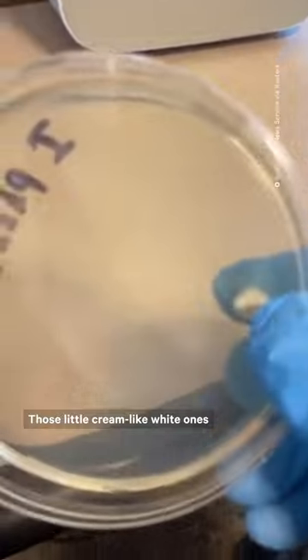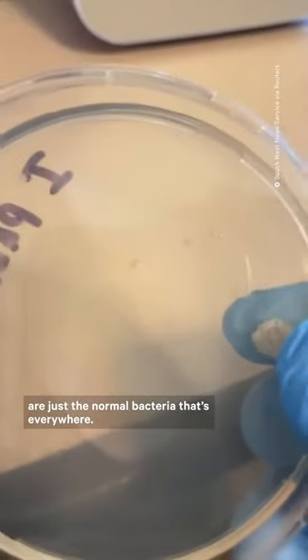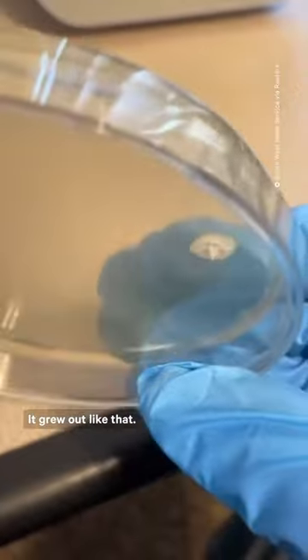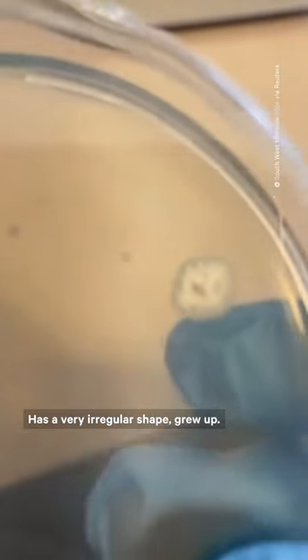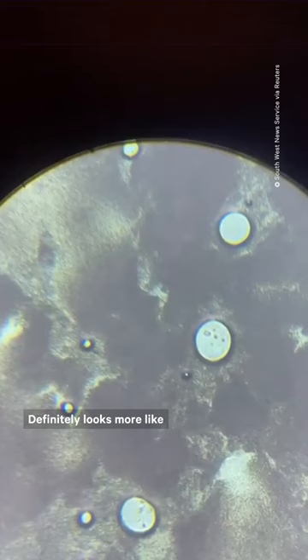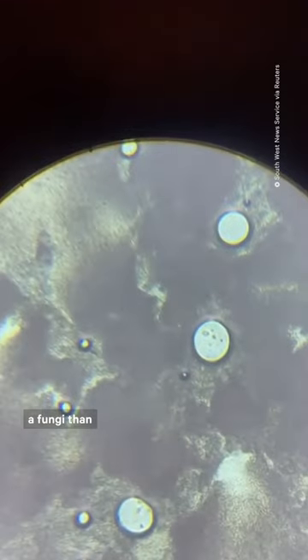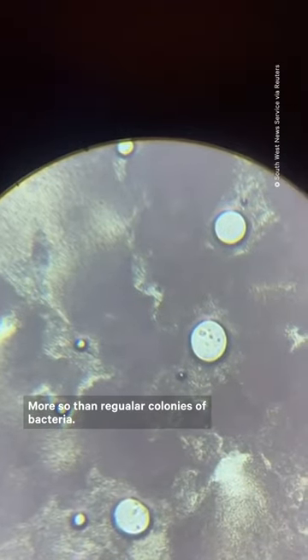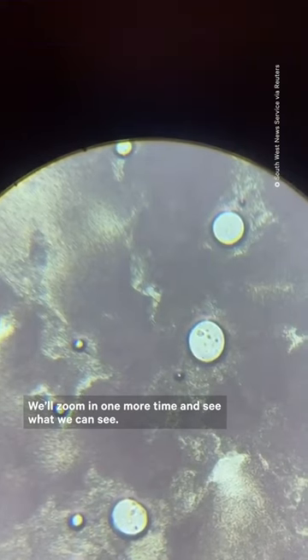Those little cream-like white ones are just the normal bacteria that's everywhere. Now this one is very interesting — it actually grew out like that. It has a very irregular shape. It definitely looks more like a fungi than like a mold or mildew, more so than regular colonies of bacteria. We'll zoom in one more time and see what we can see.